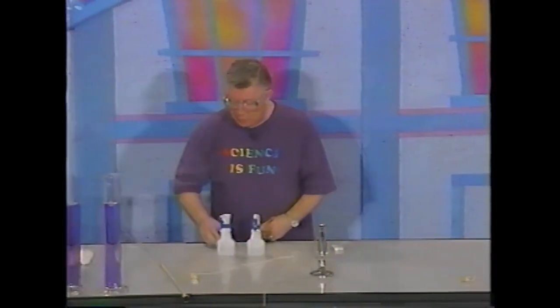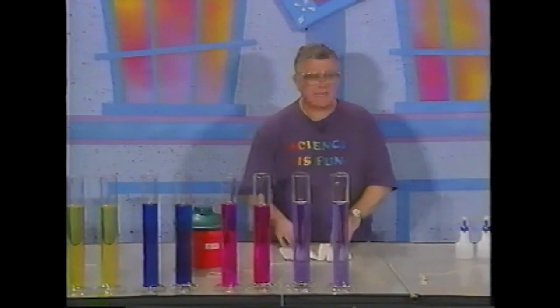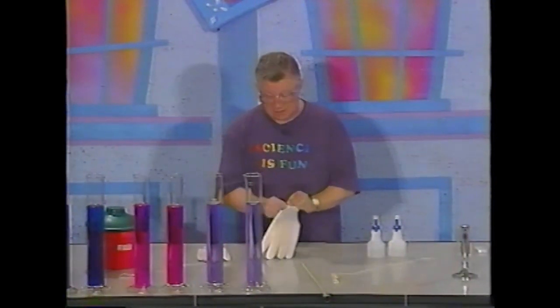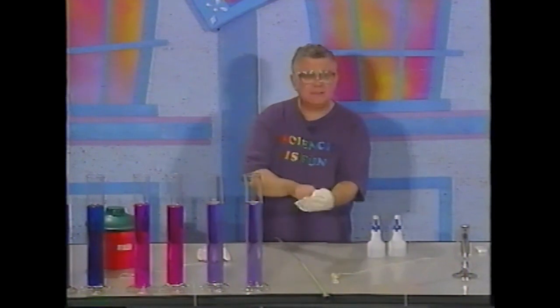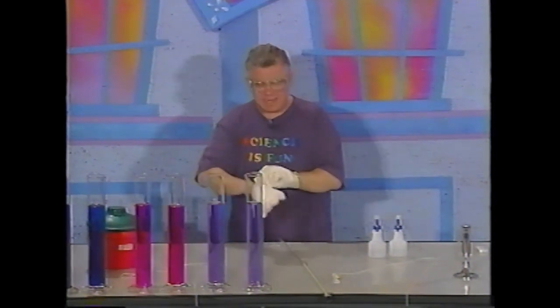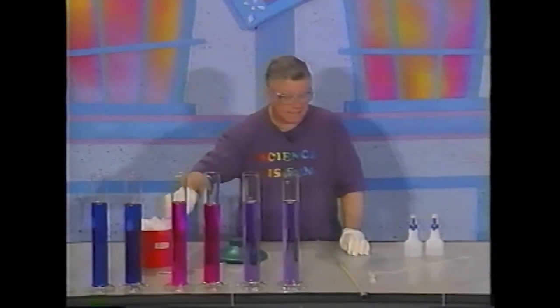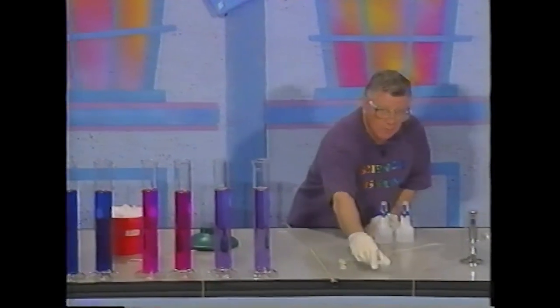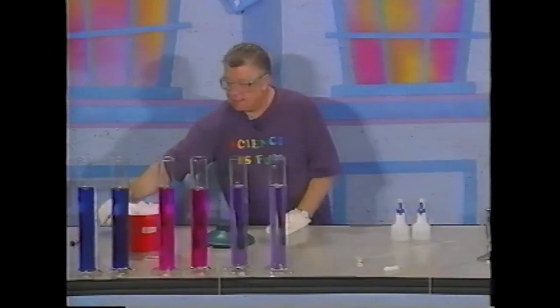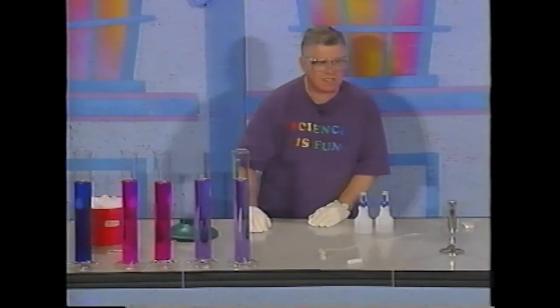All right, so what I'm going to do next is a series of experiments with a different substance. Not a gas, but this substance is a solid. And before I touch this solid, I'm going to put my gloves on because this solid is very cold. It's called dry ice. Oh, you know about dry ice, huh? Here is a chunk of dry ice, and its temperature is minus 78 degrees Celsius.